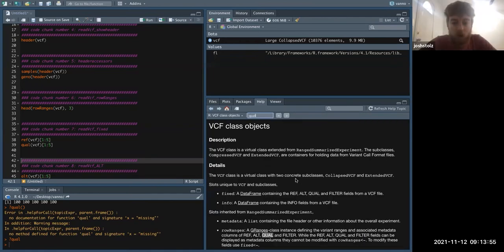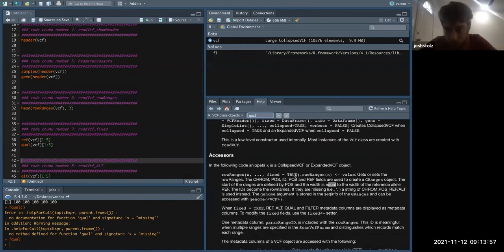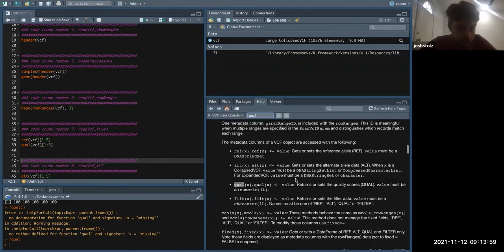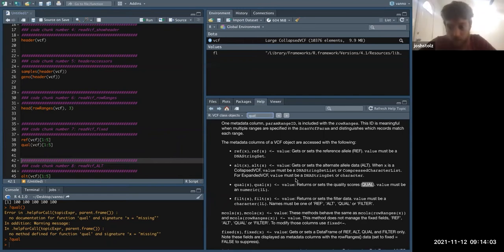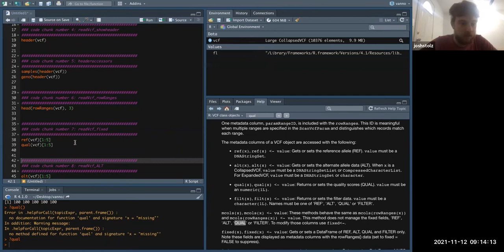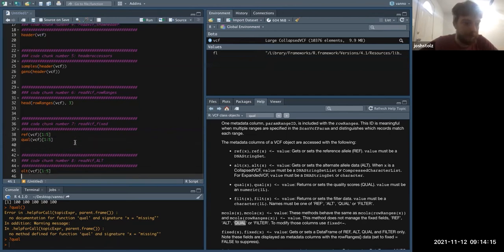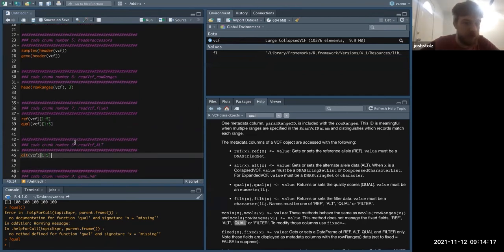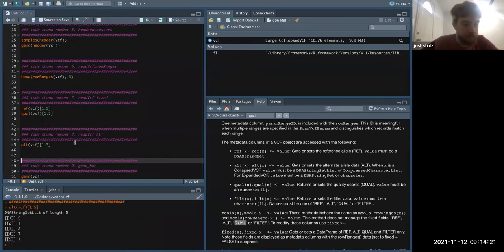QUAL is an entire field, and so just like we're calling geno, we're getting an entire field here of quality scores. And the same here — we can call the alternate allele with the alt function.